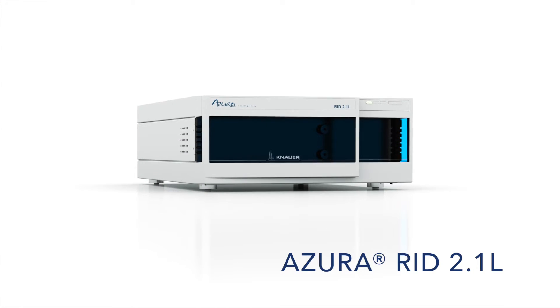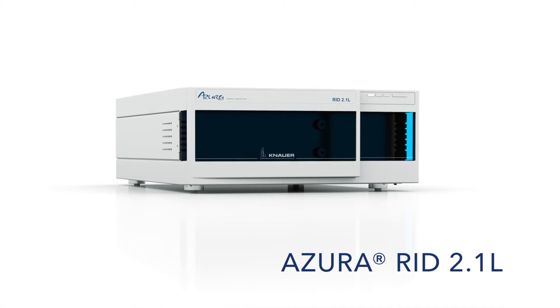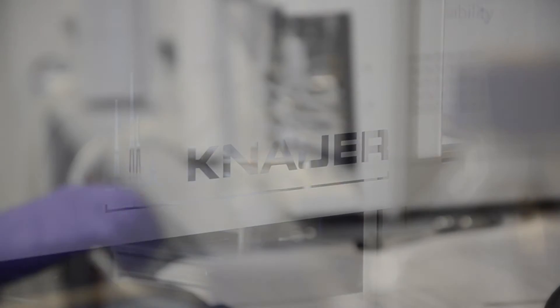We have a refractive index detector, the Azura RID 2.1L. We mainly use this detector for analytical purposes, but as this detector can also work up to 10 milliliters per minute, we can use it also for semi-preparative purification of xylitol.